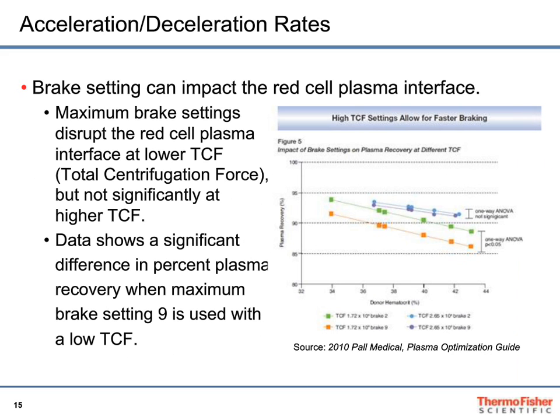So another thing here to talk about, which is a little bit subtle, but some of you will know everything about this, and it's called acceleration and deceleration rates. You remember in the first picture I showed the motor drive down there. Well, absolutely, most of the customers are in a hurry, we know. Most of our users, they want to get the centrifuge started, they want to get up to speed, get in their 20, 30 minute, 2-hour run, whatever it is, and get down, open up, and get their sample out.